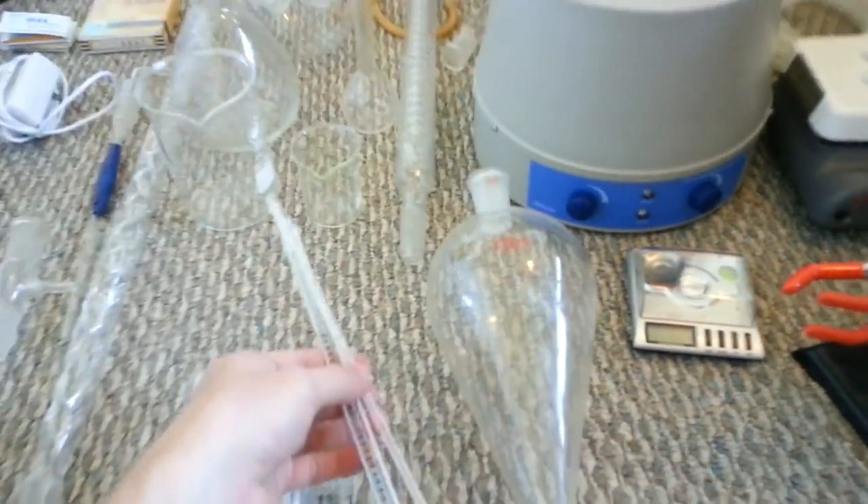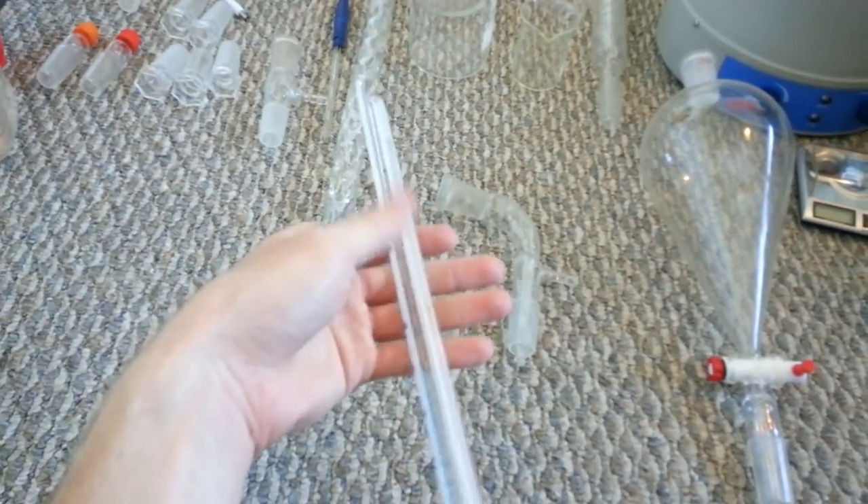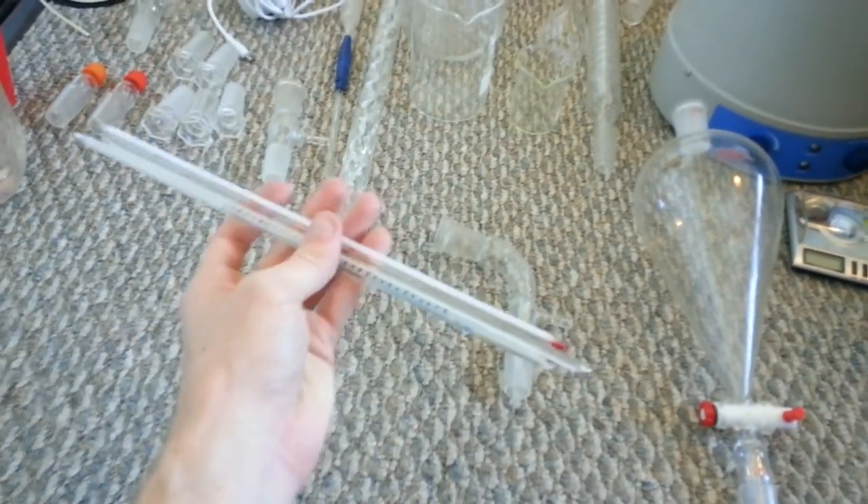Get some thermometers — get a couple of them. Don't just get one because they tend to break fairly easily. These go up to 200 and 300 degrees Celsius. I had four of them, but then one broke, so that's why I have three now. Good to have — you should get some.